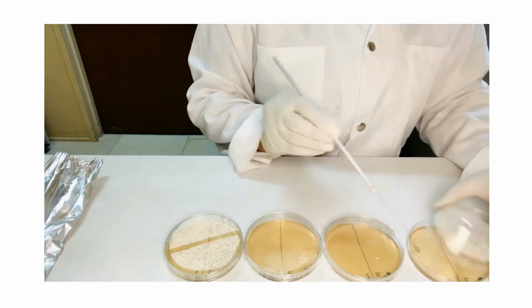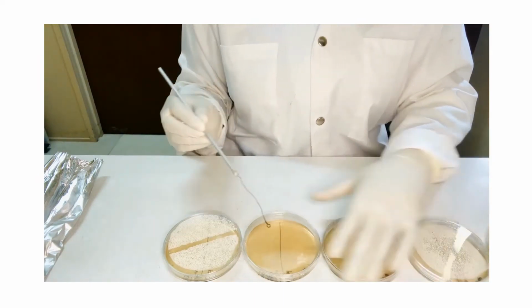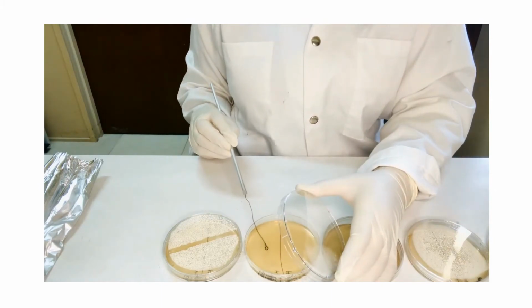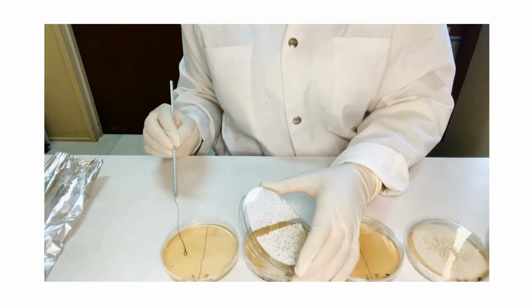The loop is touched lightly to the surface of the agar in the middle of each section marked Region 1 on each of the 5 plates. At the end of the process, each plate is inoculated with bacterial strain 1 in Region 1 of the plates.